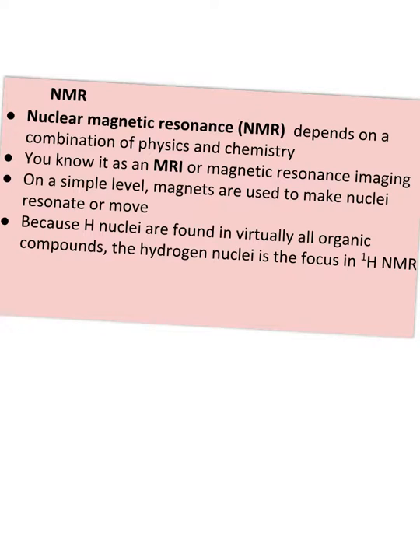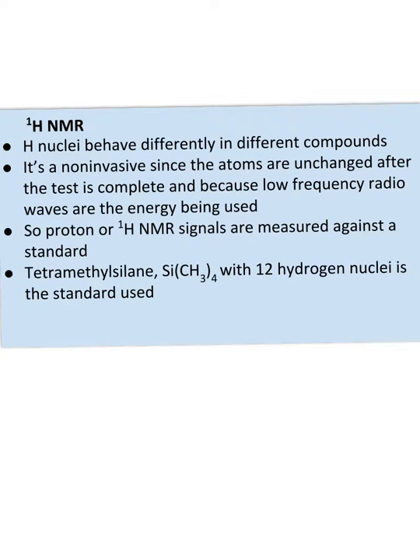And because the hydrogen nuclei are found in virtually all organic compounds, the hydrogen nuclei become the focus in what's called H1 NMR. So the hydrogen nuclei are going to behave differently in different compounds. And the whole procedure is going to be non-invasive since the atoms are unchanged after the test is complete, and you're just using low-frequency radio waves to create the energy, or to create the resonance.